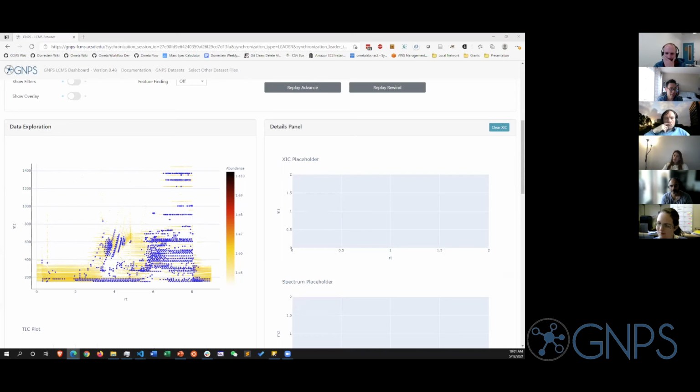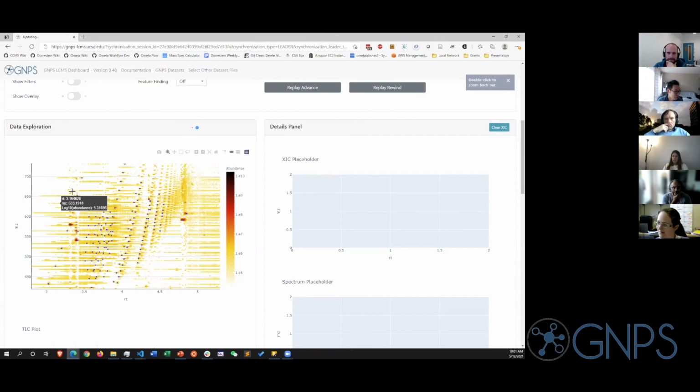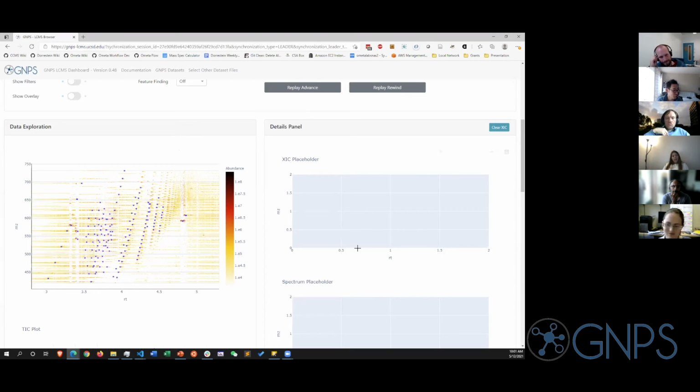Awesome. Okay, so what you should be able to see on my screen, I've loaded a new file, and so you should be able to see the same heat map as I'm seeing on the left side. What I'm going to do is start zooming in here, and it'll sharpen, and similarly, oh boy, let's look at the server. It should hopefully sharpen, and then all of you should be able to see it. It'll zoom in automatically for you.